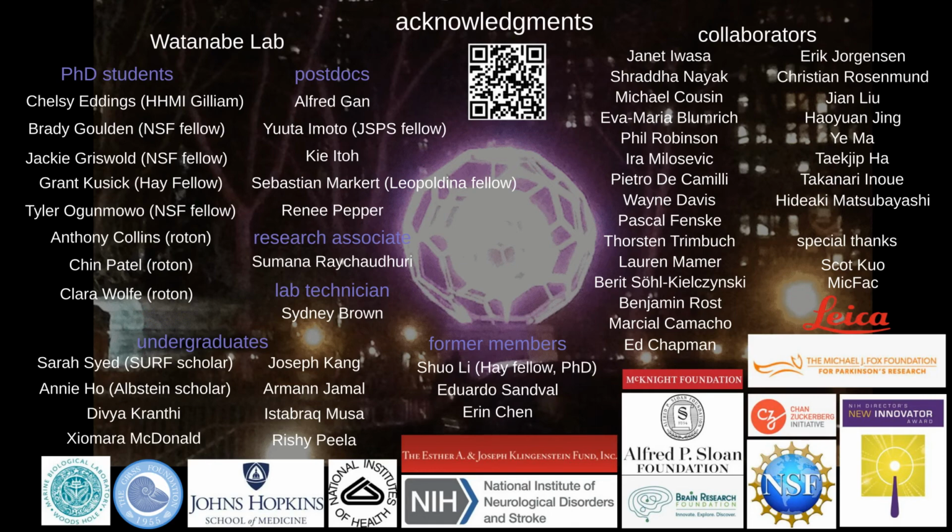Okay, I can take this question. So this is actually quite a difficult question to answer, but I can tell you that there are some artifacts that you may get based on ice crystal damage, ice crystal formations. When the ice crystal forms, you can get membrane breaks, as I presented, and you do see some evidence of that when you look through the images, so you do get some sort of artifact.